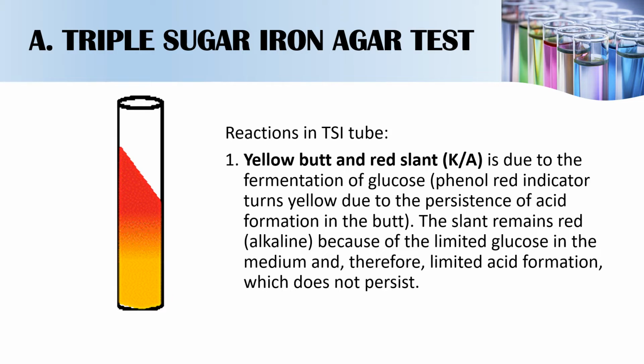The slant remains red or alkaline because of the limited glucose. Remember, we only have 0.1% of glucose compared to the other sugars present in the medium, and therefore limited acid formation which does not persist.